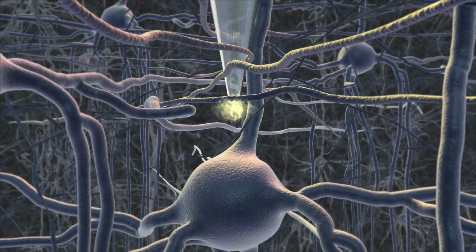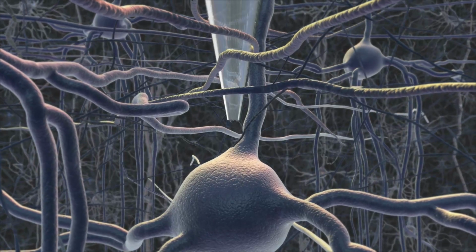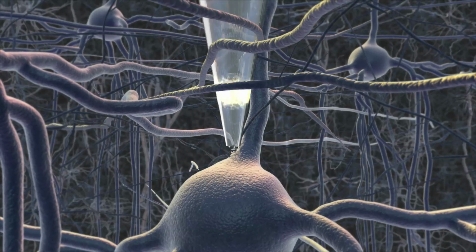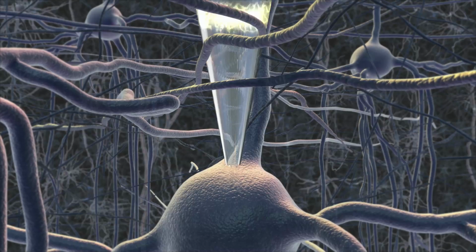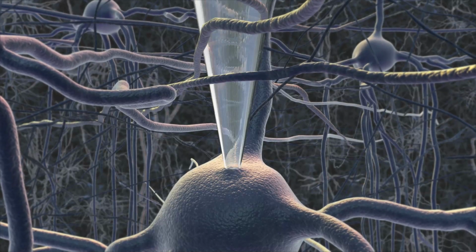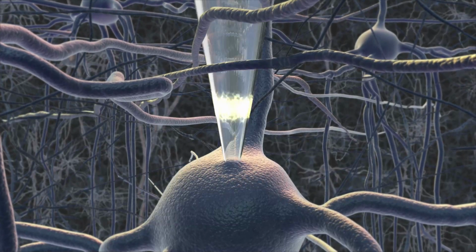The software running the robot monitors these electrical signals over time. This software, in essence, equips the robot with a bit of intelligence, enabling it effectively to see a cell when it is nearby. When it detects the blockade of the flow of electricity, indicating a neuron to be present, the robot halts the motion of the pipette. Then the robot applies a bit of suction to the cell, bringing the cell's membrane or boundary in close contact with the pipette tip.